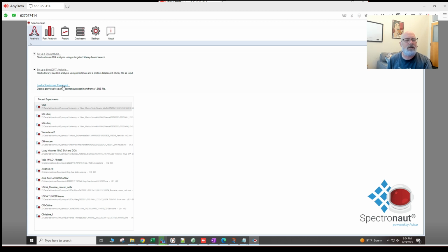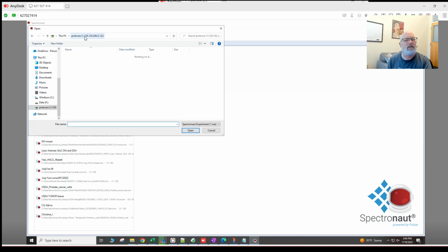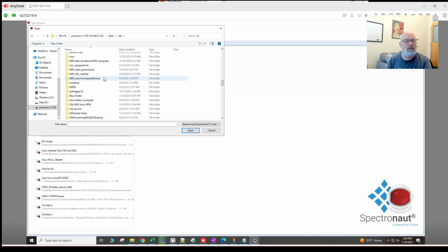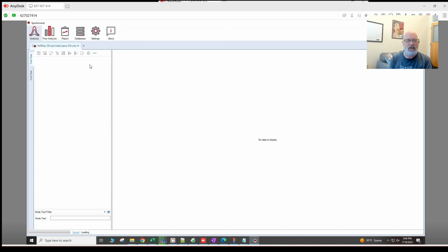All right, so let's open that same result in Spectronaut. I think I have it in the lab timsTOF HT initial specs folder. I believe I have a Spectronaut result here. Let's open it.